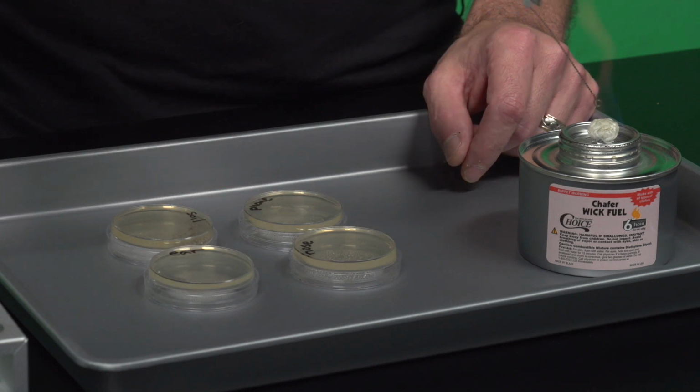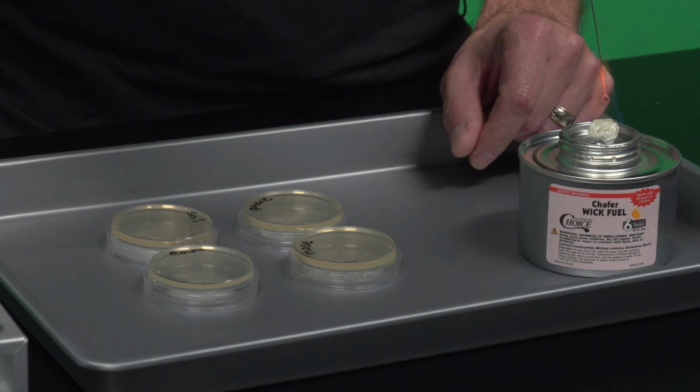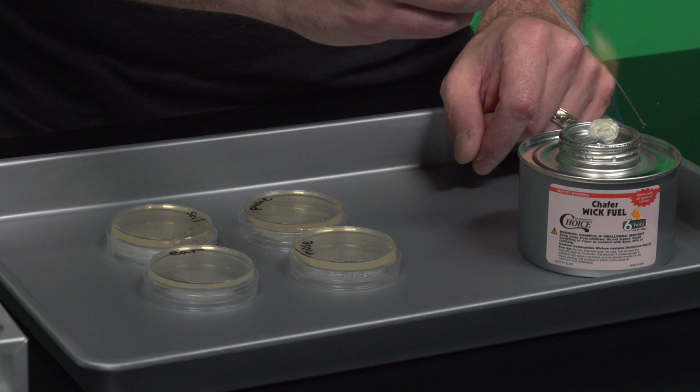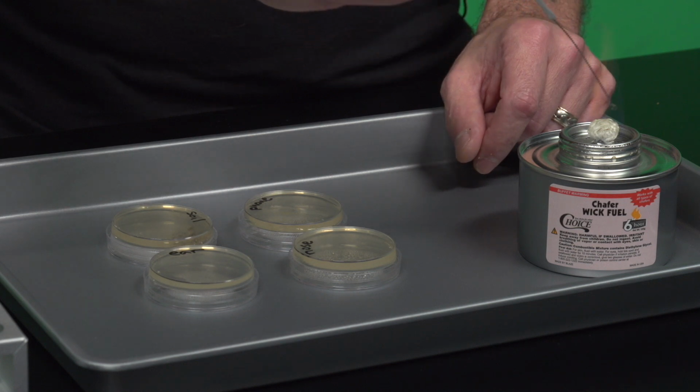So instead what you want to do is actually angle it up like this. Okay, and you see how the end there, it's getting red hot? That will incinerate any bacteria or fungi or viruses that are on there. And then what you do is you slowly move the loop all the way down so that the entire braided part essentially gets red at one time or another.